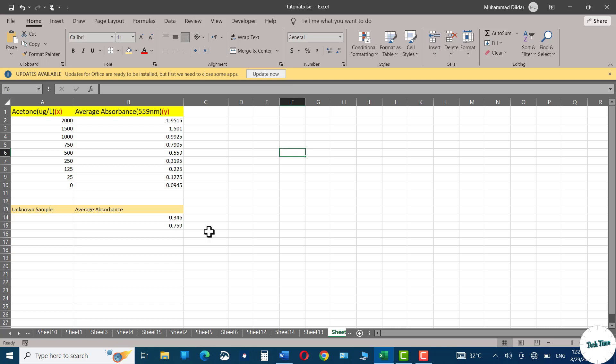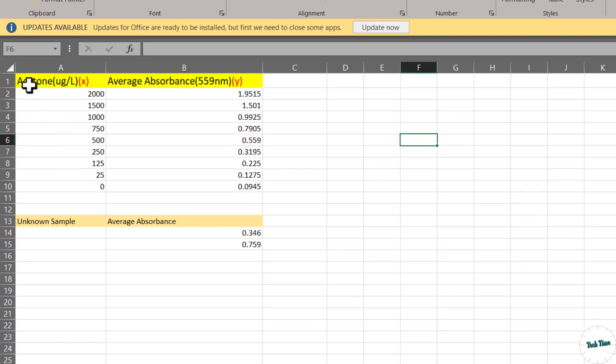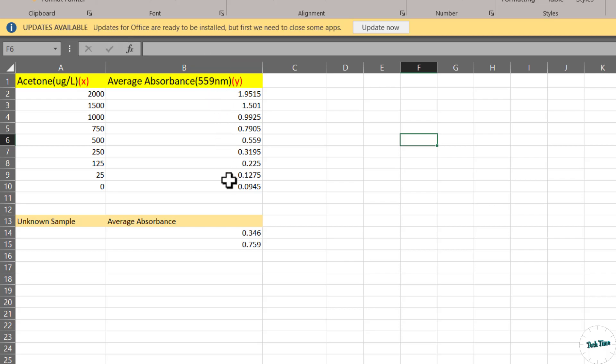I got my Excel sheet opened and right over here you can see I have some data for various water samples containing acetone in microgram per liter. Column B shows the absorbance values for each of these samples.